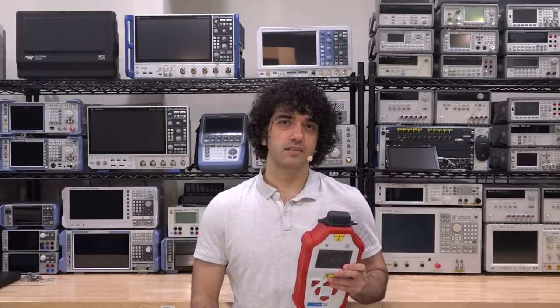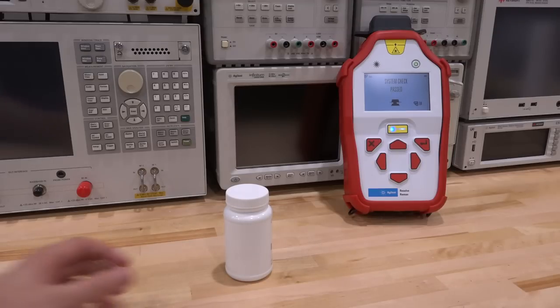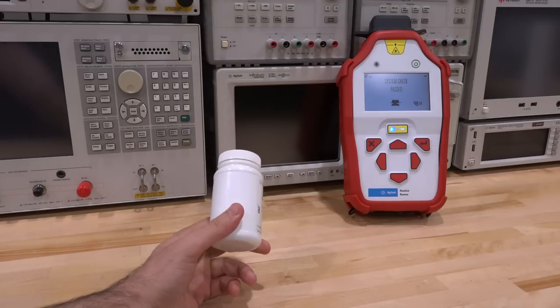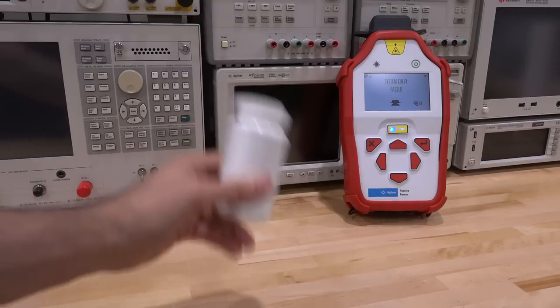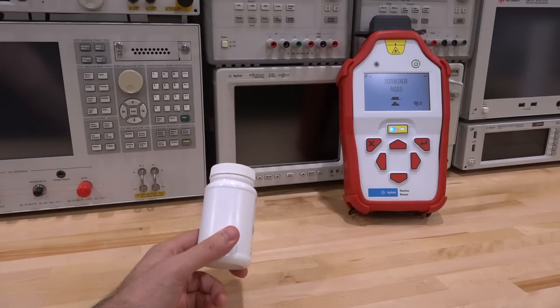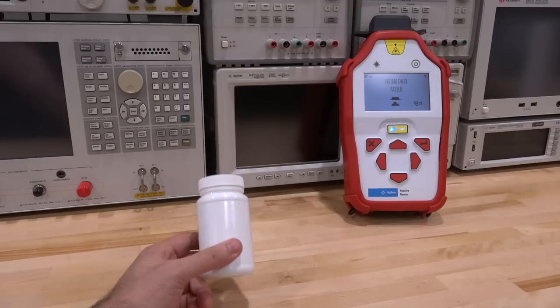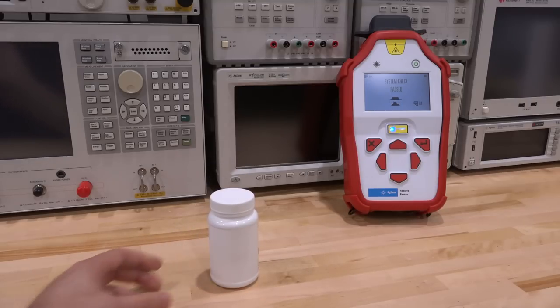Watch this. Consider the following situation. I have this mystery bottle. When I squeeze it, it feels kind of soft, so it's made of perhaps some type of plastic. When I shake it, there's definitely a powder inside, but the bottle is completely opaque. I cannot see inside of it at all. I can't even tell what color that powder is, but I do want to know what that powder is made of. What is its chemical composition? Is it dangerous? I want to figure it out without ever having to open the bottle, because it could be dangerous and you may not even be allowed to open it in the first place.